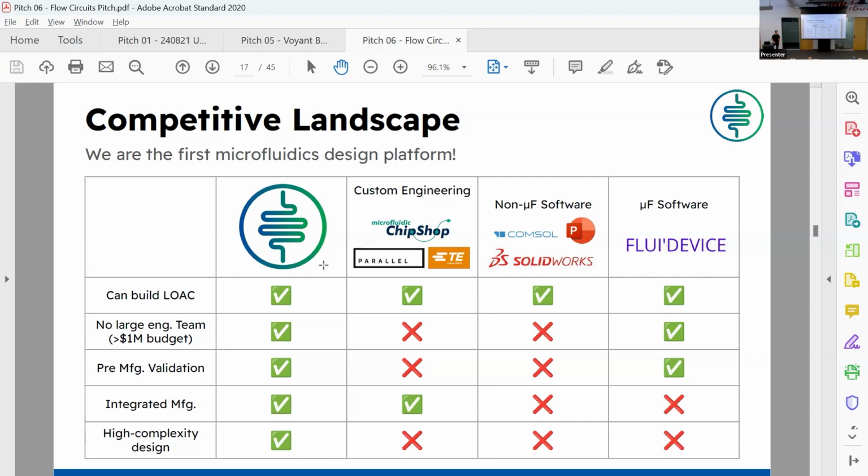And that's our deliverable. And as you scale, will you always be doing that deliverable part, or would that deliverable part be localized, regionalized, customer have it on site? So to be clear, it is a marketplace. So we're not running the machines to go make these things. There may be assembly steps that we will take care of. So bringing in their custom reagents into blister packs, bringing in their lyophilized beads, their mag beads with functional surfaces. We can do extra fancy stuff in here.